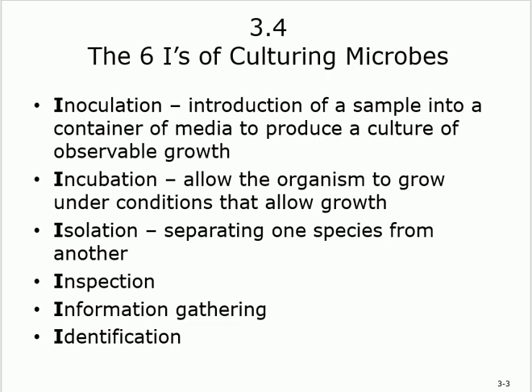What's an incubator? It's a medium that contains everything needed for that baby, right? Same thing here. You put it in a medium that contains everything, including the temperature, including the amount of air, oxygen, everything. And we'll go through that.